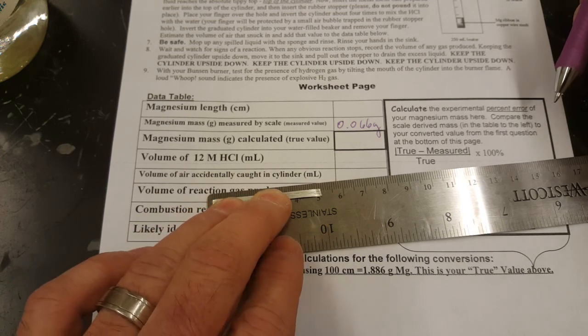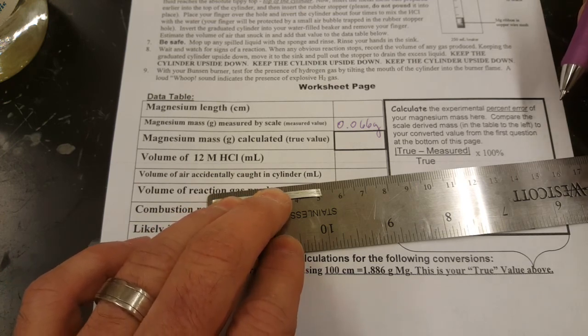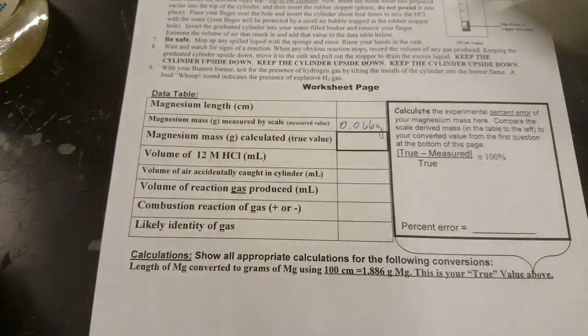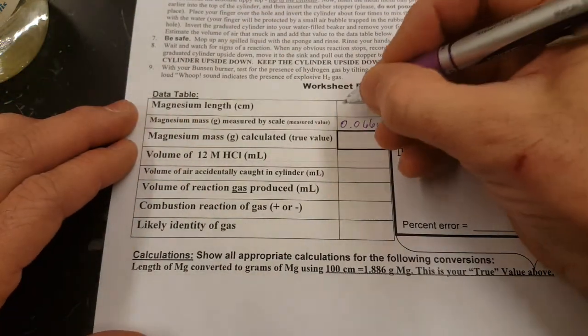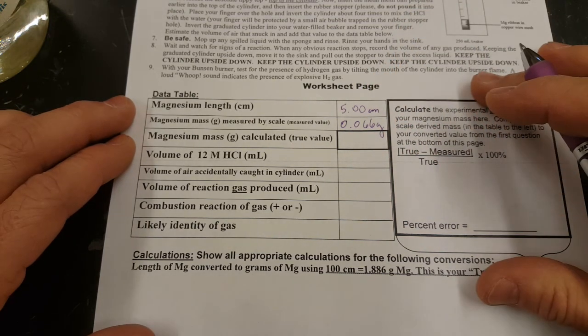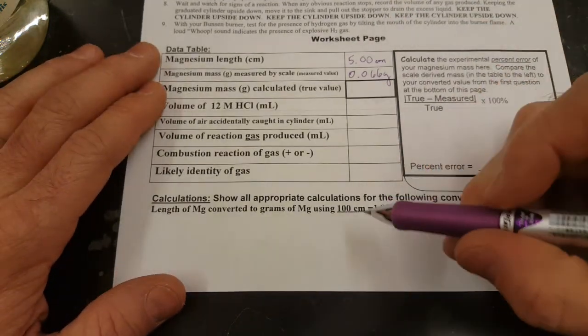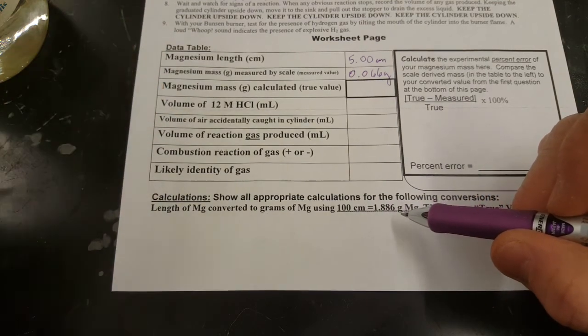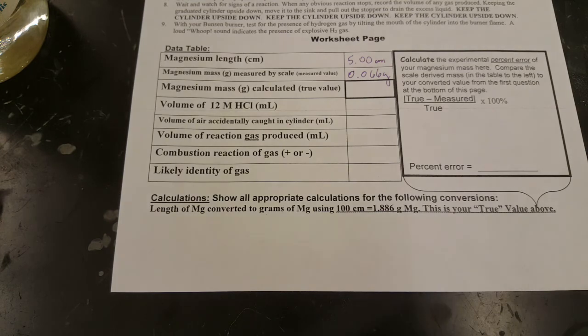And my lab assistant was amazingly precise here and cut a 5.00 centimeter piece of magnesium. That's convenient because down here I have a ratio of length to mass for the magnesium strips that I'm using.